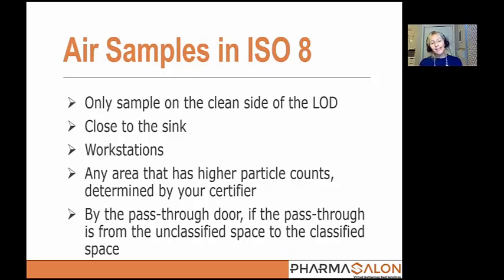In some ways, this is kind of setting us up for failure, not so much from exceeding the action level from a count standpoint, but because then the chapter went on to say, hey, if you have gram-negative organisms in your space, you have quote unquote highly pathogenic organisms, which means you must immediately remedy the situation. As many of you are familiar, that turned into you fail, basically, and it presents a real challenge.